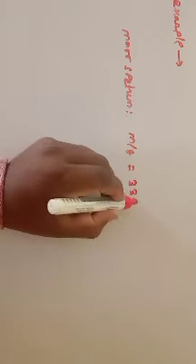Its mass is given, that is 339. So up to this point we have H1 NMR, then IR, and then mass.